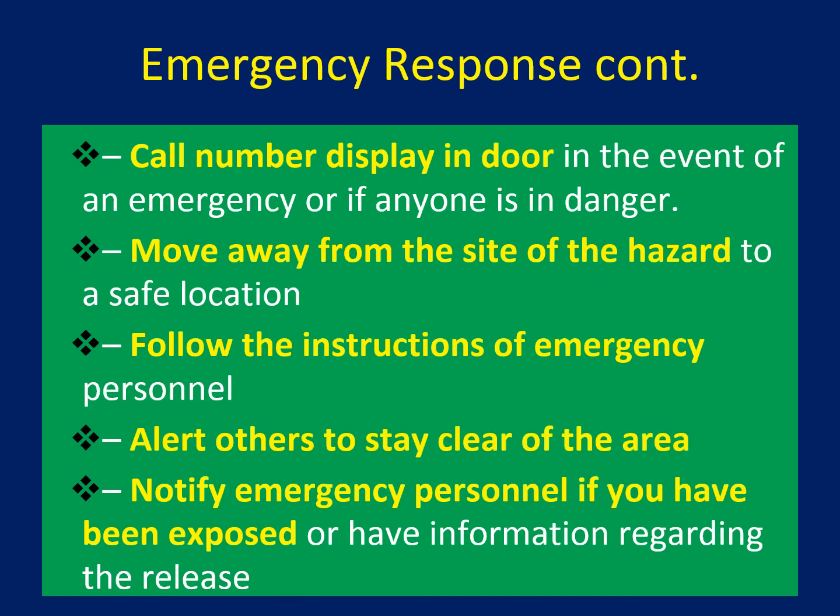And there are some other emergency responses. Call the number displayed on the door in case of emergency, in case of danger, and then move away from the site of the hazard to a safe location, and then follow the instructions from emergency personnel, like a safety instructor. You can call him, you can call the head of the department, or you can call me and ask any questions at any time in case of emergency.